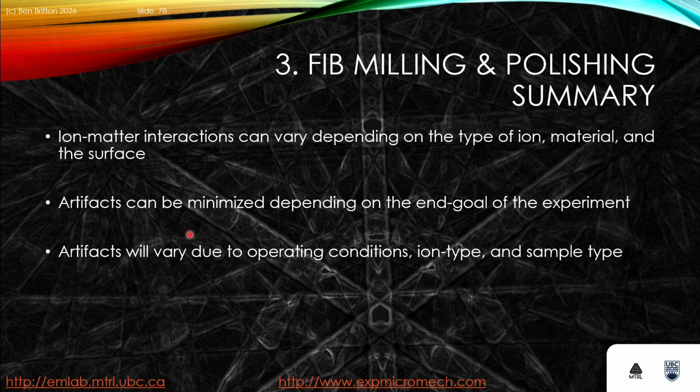These artifacts will also vary due to the operating conditions, the ion type and the sample type. Generally speaking, you can probably borrow a lot of conditions from a sibling experiment prior to applying it to your material system. Most people who have a FIB have a reasonable amount of experience of these things, or you can ask the manufacturer and their applications team for some advice when required.